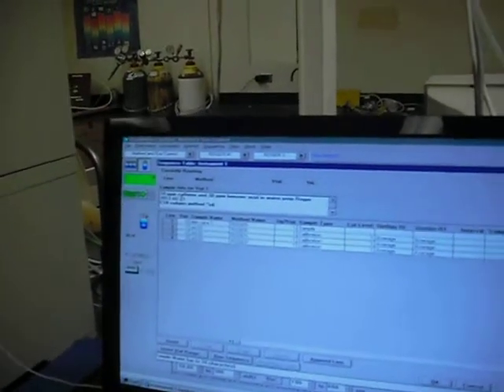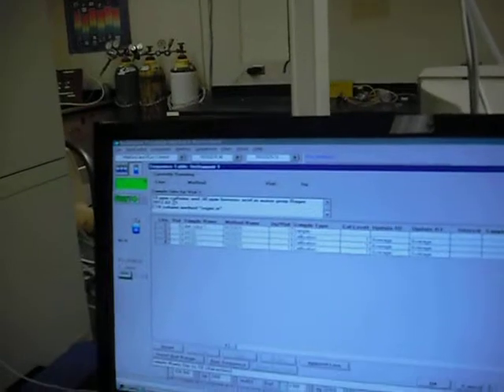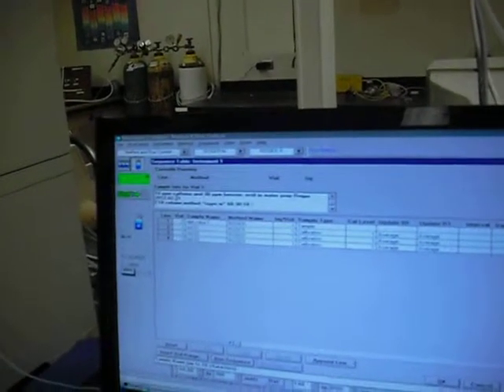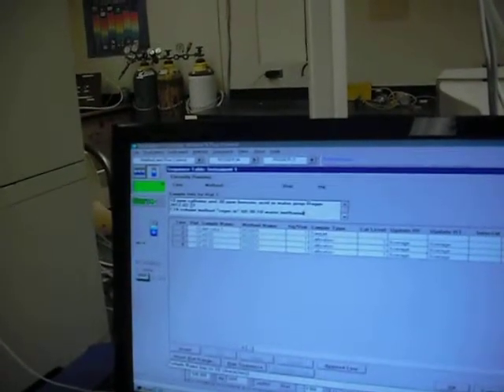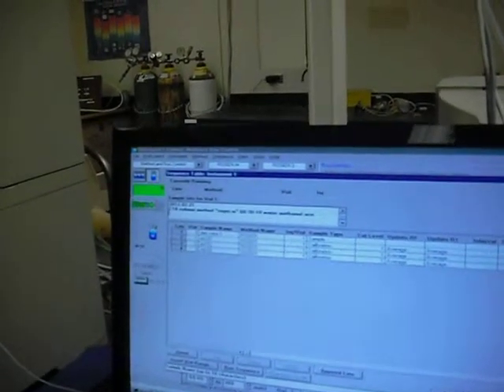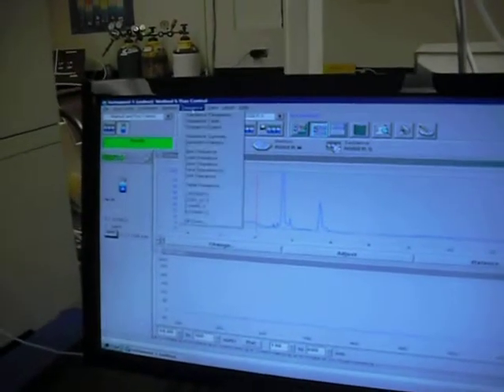You could also specify C18 column, method, roger.m, 60, 30, 10, water, methanol, acetonitrile. And then so on and so forth for the remaining standards. Then you OK that and do sequence, save sequence as, roger.s works, be OK.